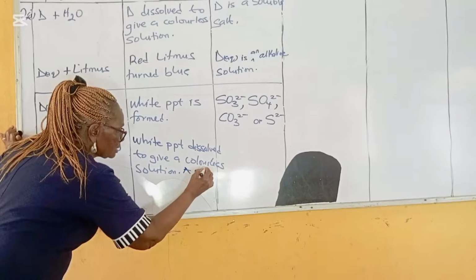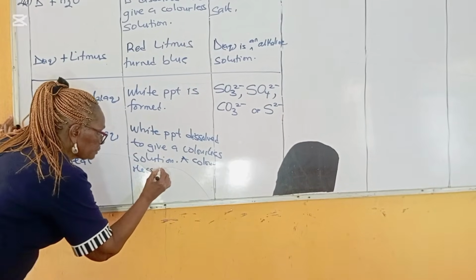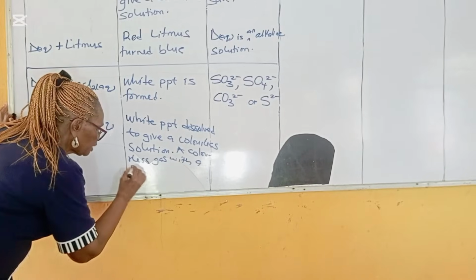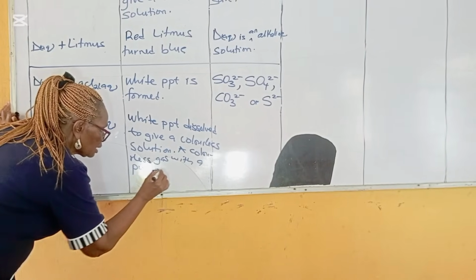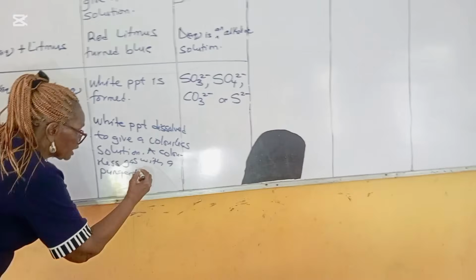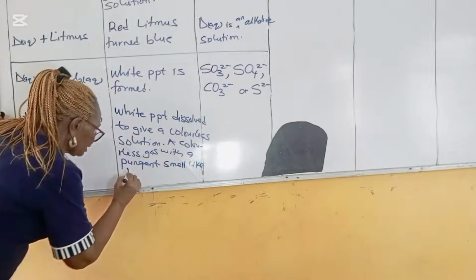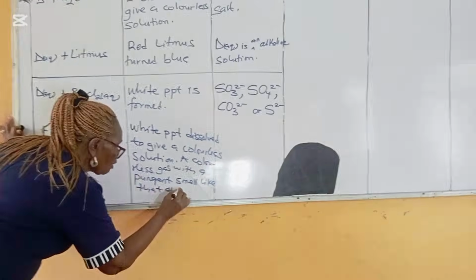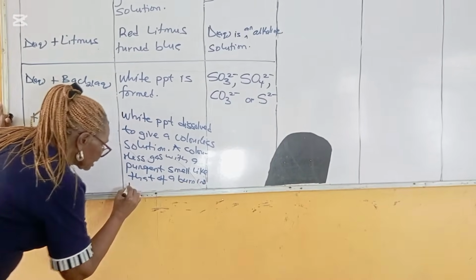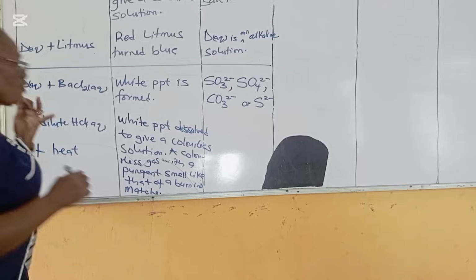A colorless gas with a pungent smell. You can even tell them that you know what you're doing. A pungent smell like that of burning matches evolved.